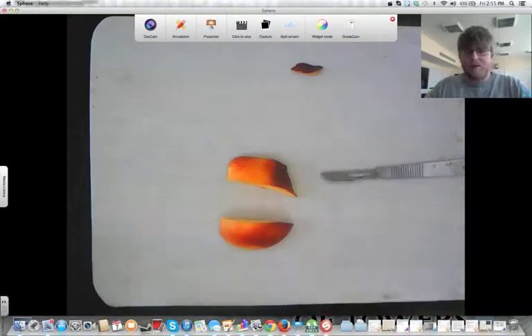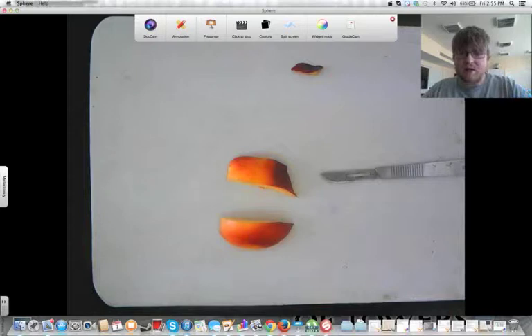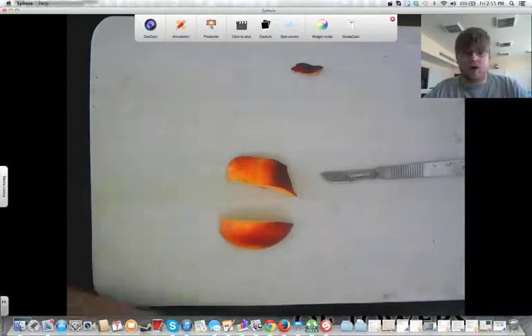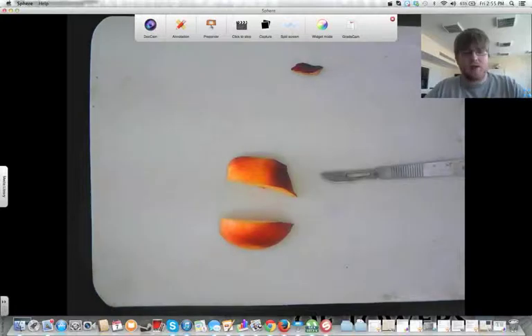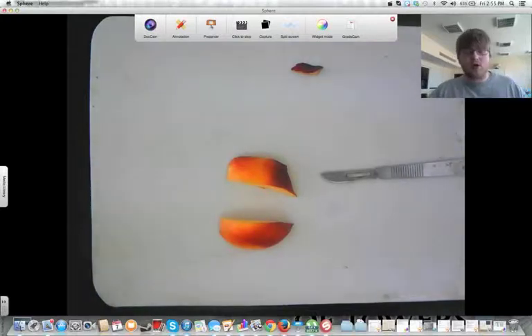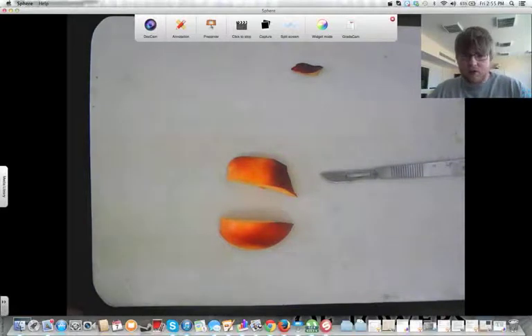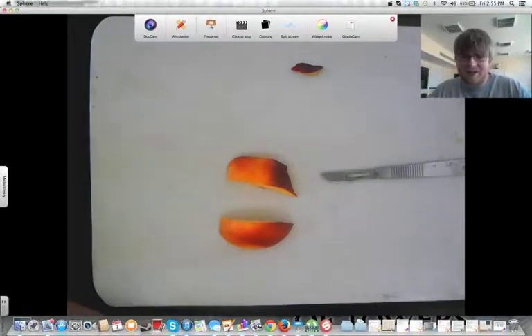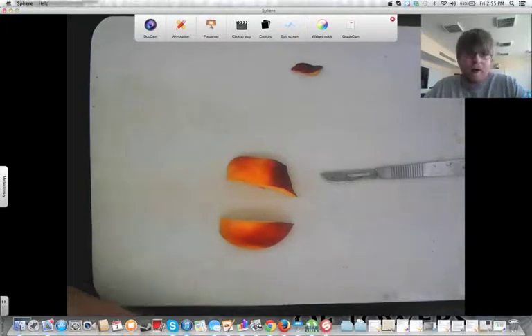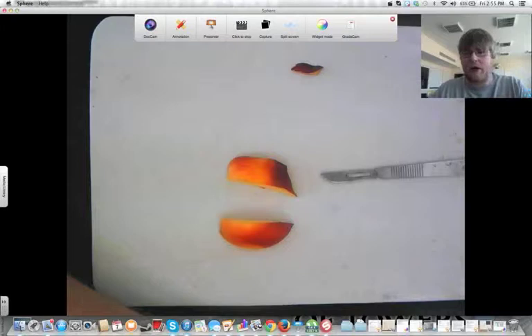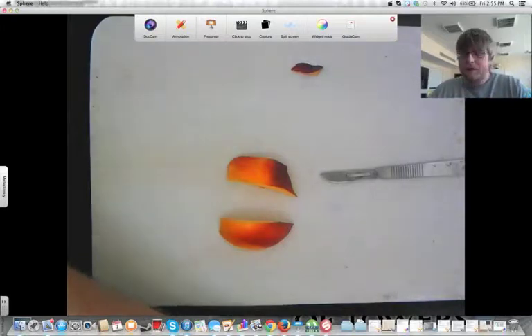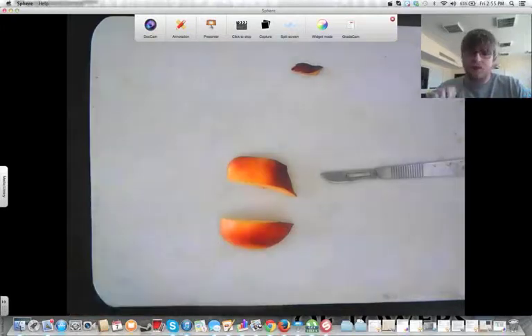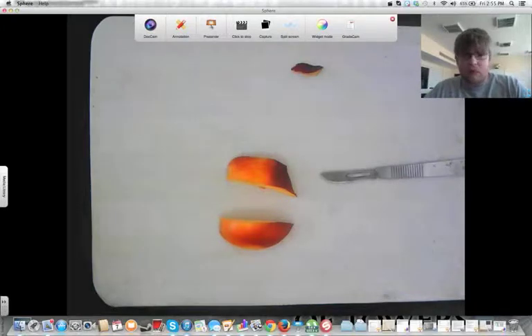Speaking of fingers, when you are doing the dissection, you always want to make sure you have gloves on. Now, I'm just dissecting a nectarine right now, so I'm not wearing them, but in whatever video you're watching next for your class, you will see that I'm wearing gloves. And you always wear gloves because bacteria and stuff get into animals and plants and whatever you're dissecting. We don't want this to get into our hands, then get into our eyes, get into our mouth, get into our body.